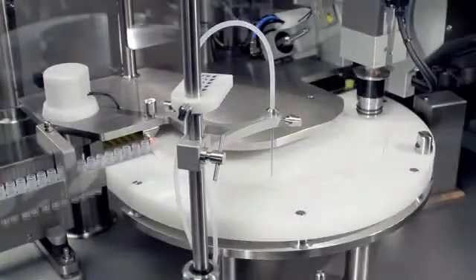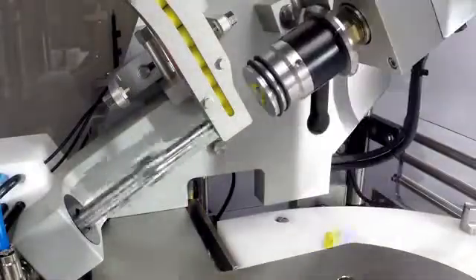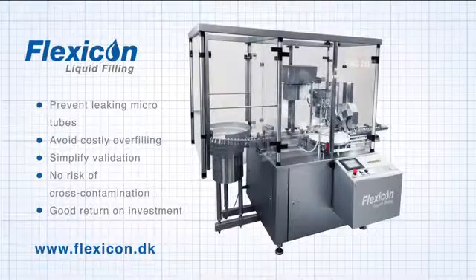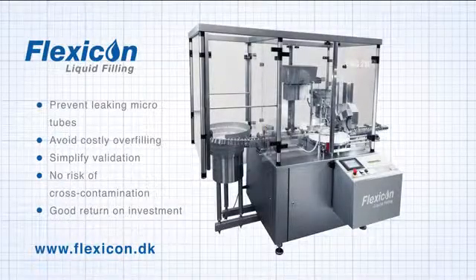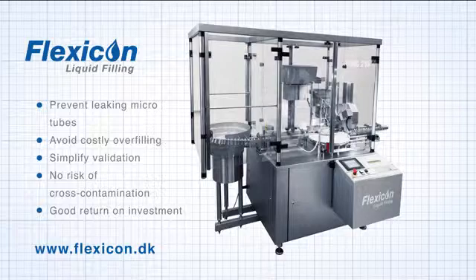The systems are extremely reliable, deliver improved flexibility, reduced production costs, minimum risk of leaking containers, less costly overfilling and more efficient validation processes.